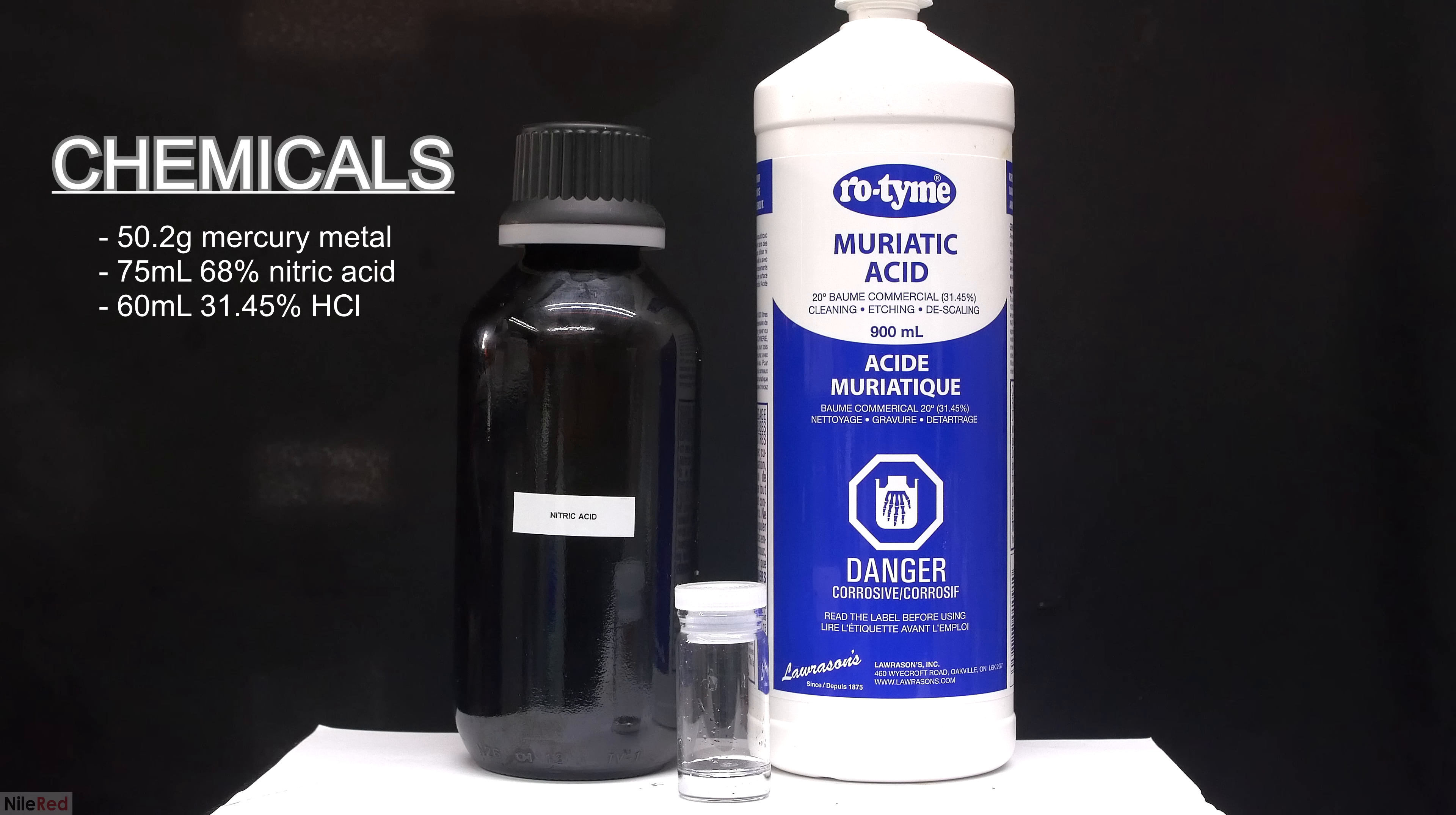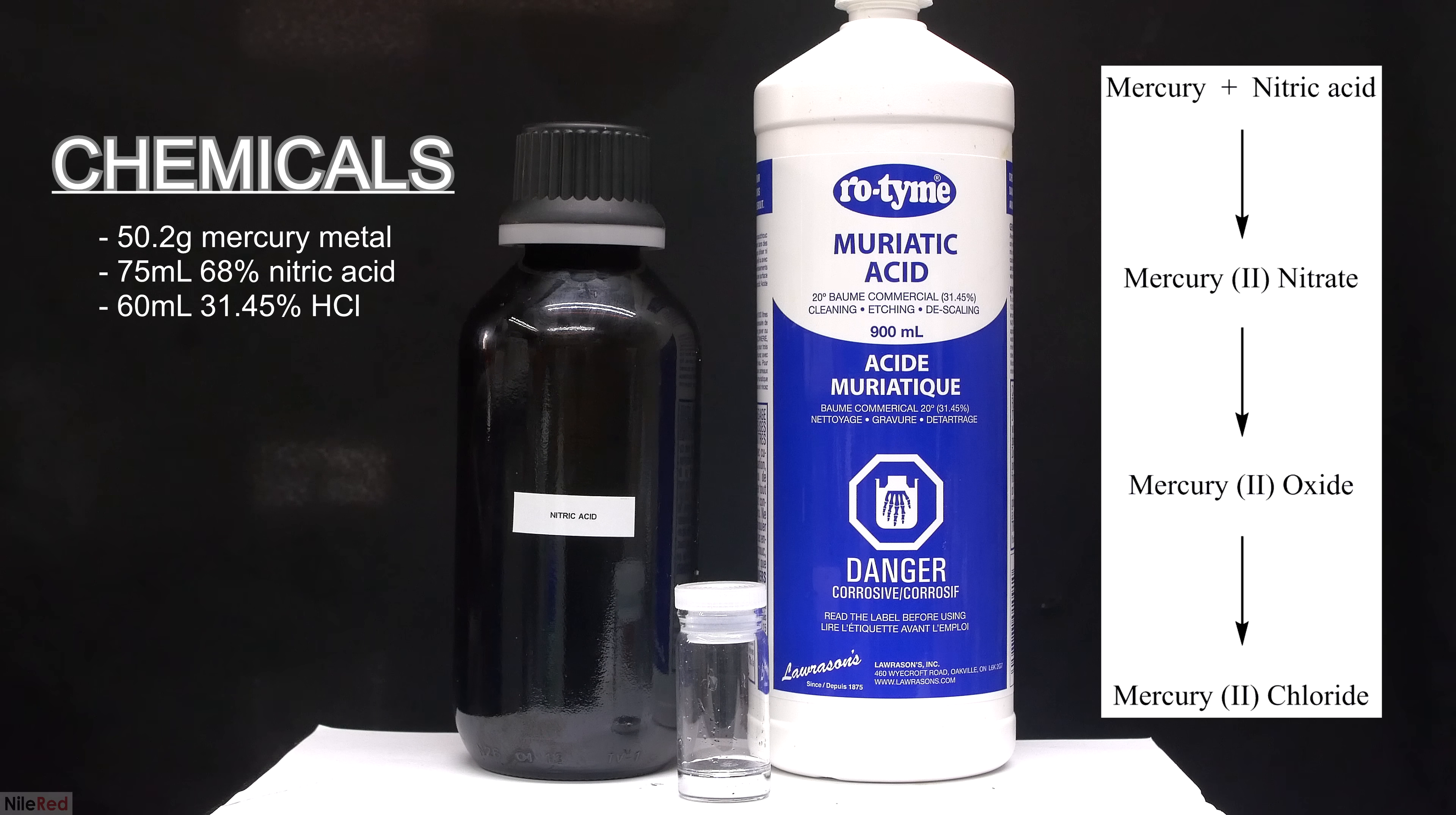To make mercuric chloride, we need three main things: elemental mercury, nitric acid, and hydrochloric acid. The general procedure for this video is to first make mercury(II) nitrate by reacting the metallic mercury with the concentrated nitric acid.